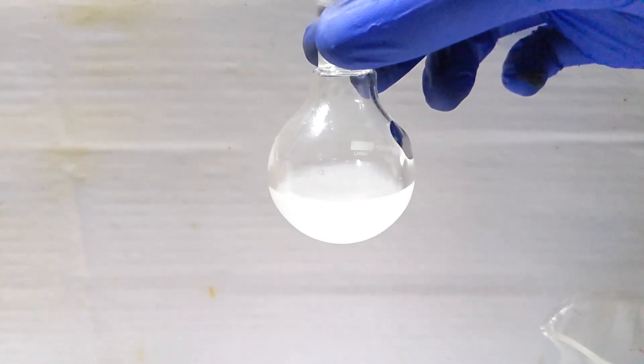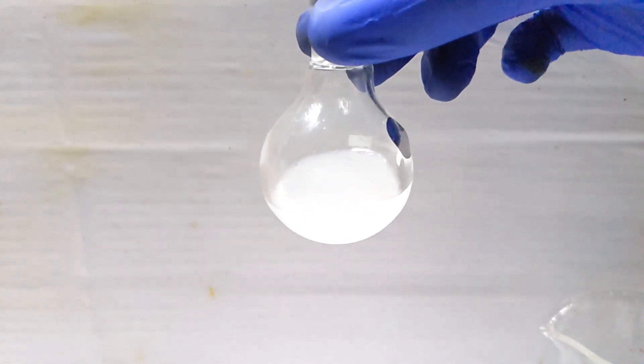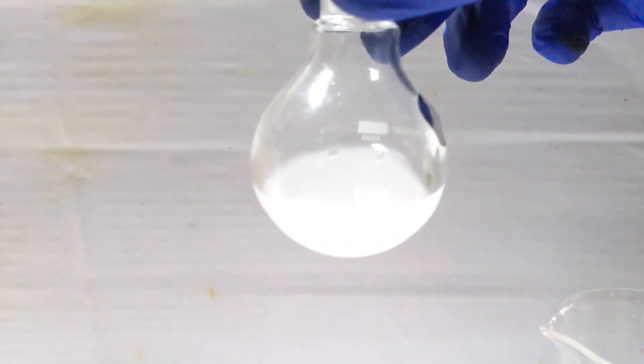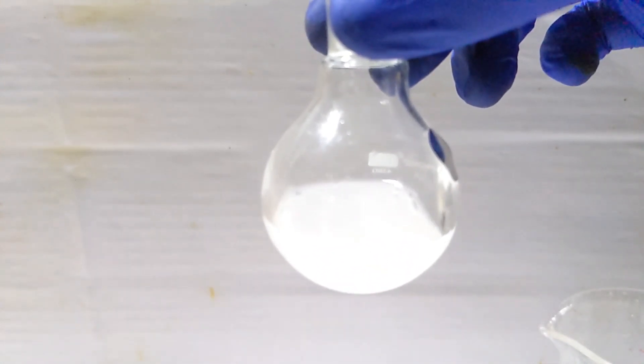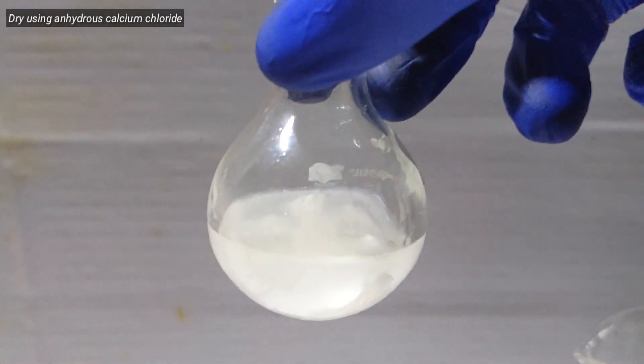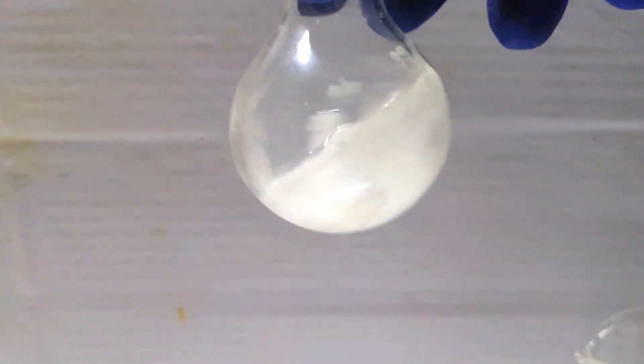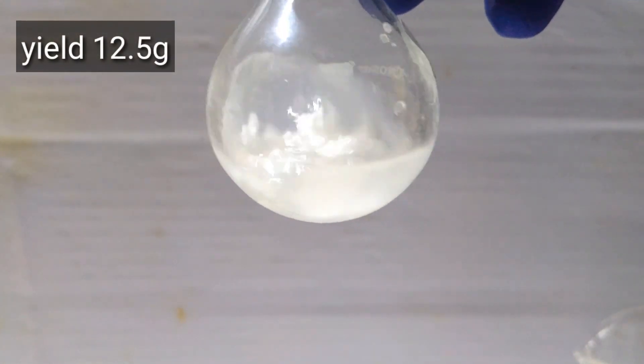The water present in bromobenzene can be removed by drying it by adding a few grams of anhydrous calcium chloride to it. The final yield of bromobenzene after drying was about 12.5 grams, which is a pretty decent yield.